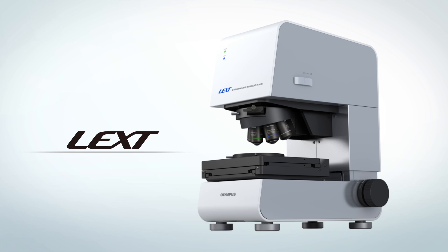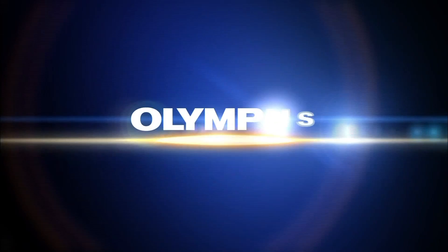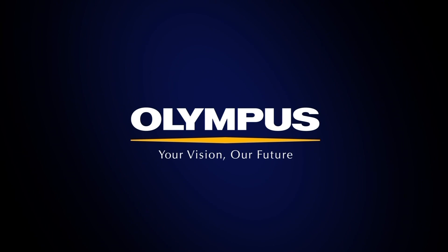Things you can do with LEXT. LEXT OLS4100.